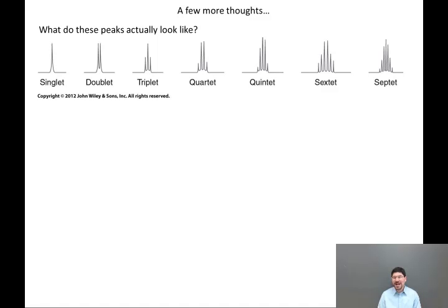There's going to be a very common arrangement, namely an isopropyl fragment, where you're going to see septets. But look at how small those end lines are compared to all the rest of the lines. In some cases, you will have to look really carefully at the spectrum in order to be able to actually make out those 2 end lines.